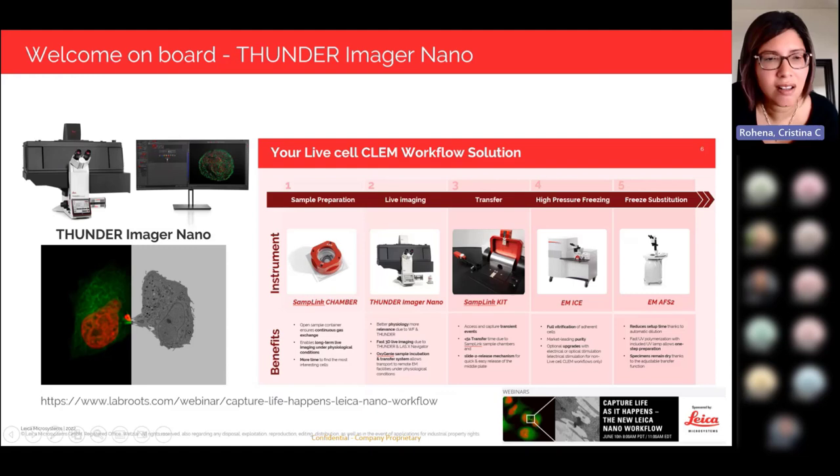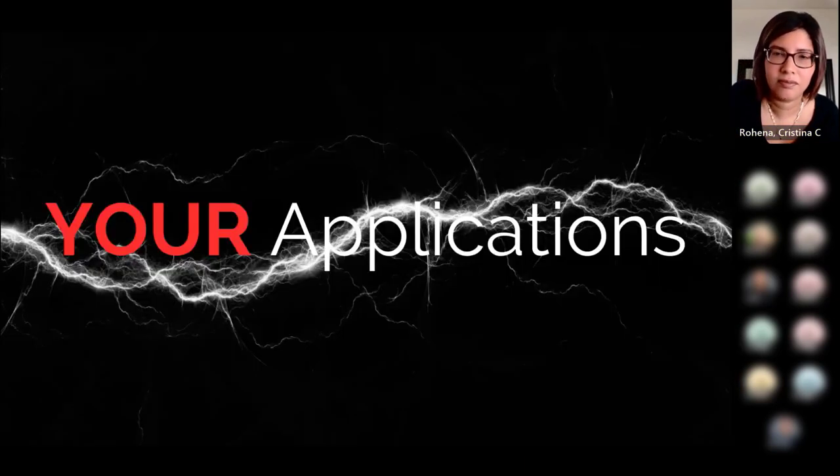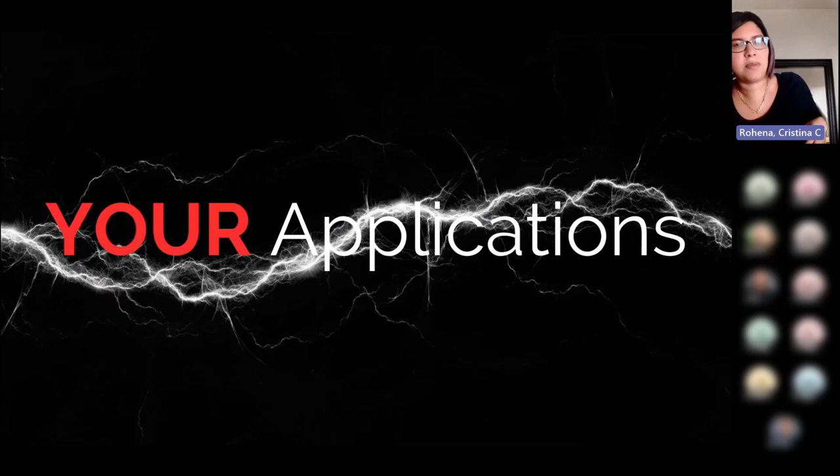If you're interested at all in learning a little bit more information about our Thunder Imager Nano, we do have a webinar that is in LabRoots that explains a little bit more about how the Thunder Imager Nano fits into your nano workflow. So now I'm just going to give you some examples of some applications that were done on our inverted systems.